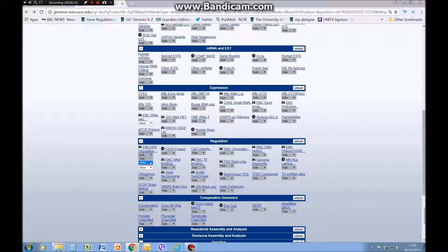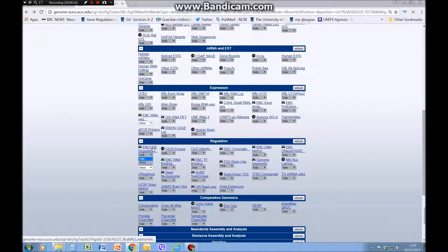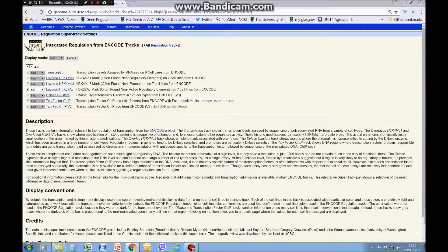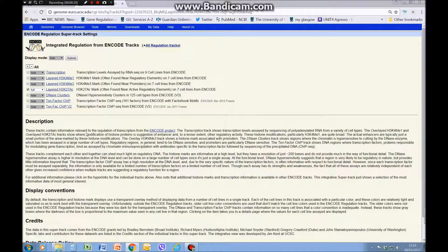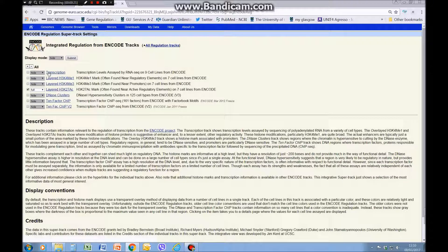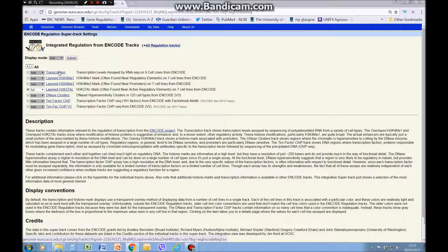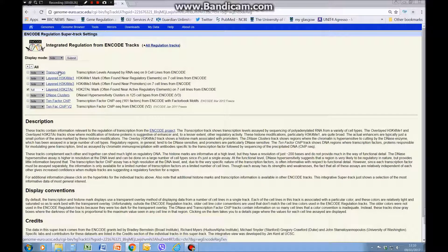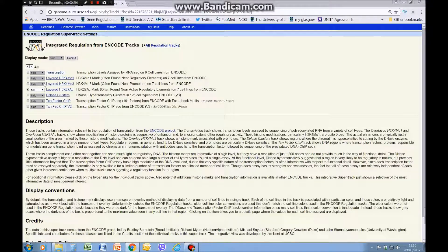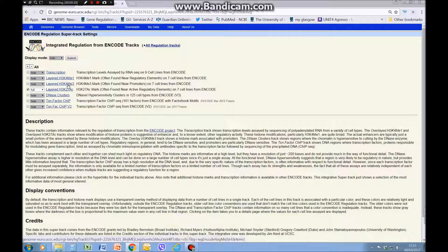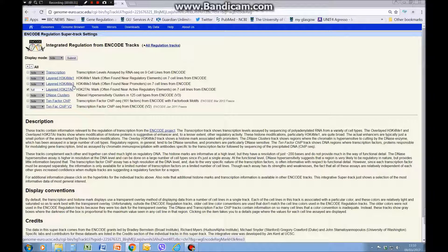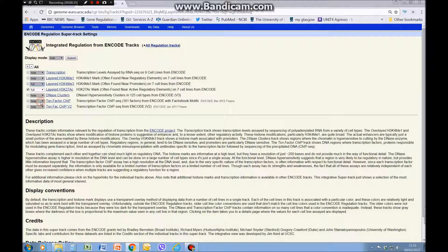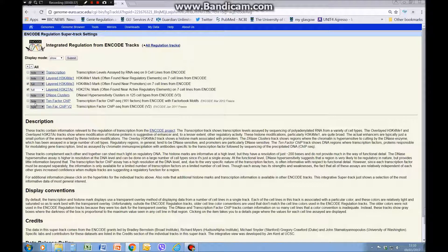We have a hide or show option, so we're going to click on the title itself. We're not going to look at transcription because you already have those tracks, but you can view these ones instead if you want. We're going to look at histone H3 lysine 4 trimethyl, which is a promoter mark, and we'll put that on full and check the box.